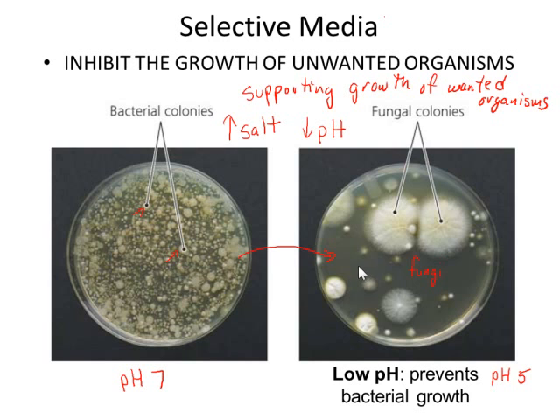And now let's say I wanted to find a new fungi. Maybe I want to find a new antibiotic growing in the molds here. Now I could characterize that mold and search for that antibiotic. Whereas if I just grew it at 7, I can't find the molds because they're being suppressed by the sheer number of bacteria that are present.